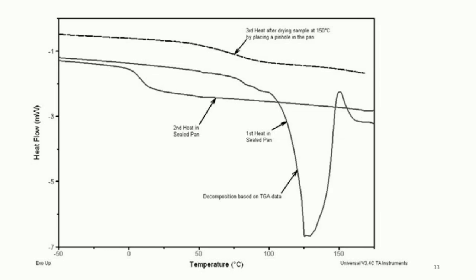It would even calculate and observe small thermal events that may occur in the form of endothermic and exothermic. It would also help magnify the peaks of exothermic and endothermic events in the whole scan region.